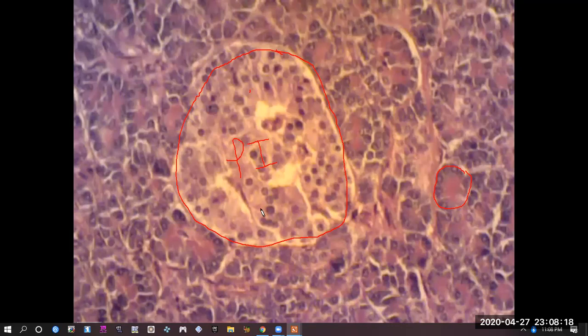But we have the pancreatic islet, and in contrast to that, what we want to see and focus on now is the pancreatic acini. So it's this portion here, the darker stained majority, that's involved in the digestive system. So that pancreatic acinar cell, making those groups, the pancreatic acini, the digestive portion of the pancreas.